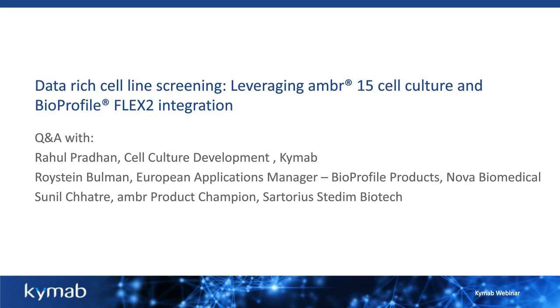So another question for Rahul. What did you do to reduce ammonium levels later in the culture in larger bioreactors? I'm not sure if you can comment on that. I can't go into the details, unfortunately. As you can see, we optimized some of the gassing strategy and other parameters, but beyond that, I can't really go into it. Thank you very much for your question. Unfortunately, Rahul is not able to comment on that.